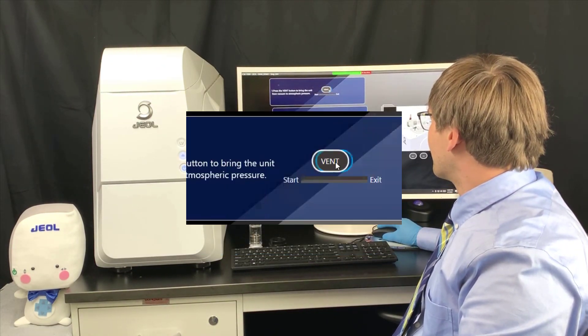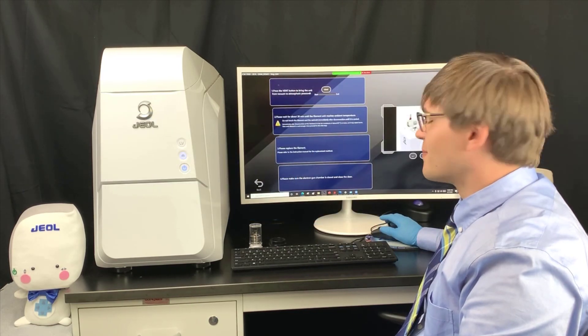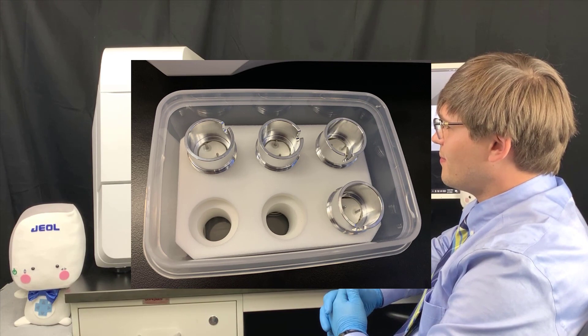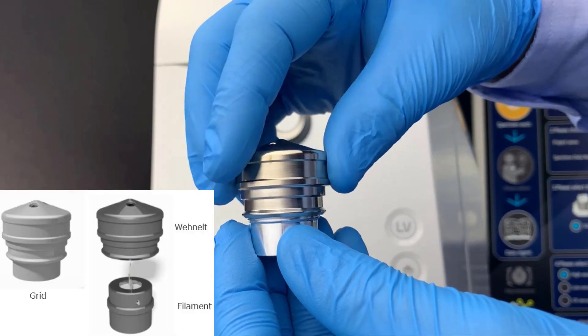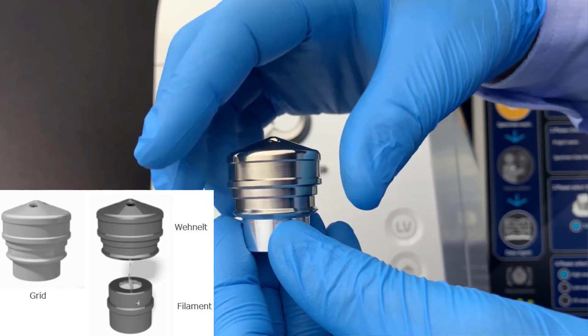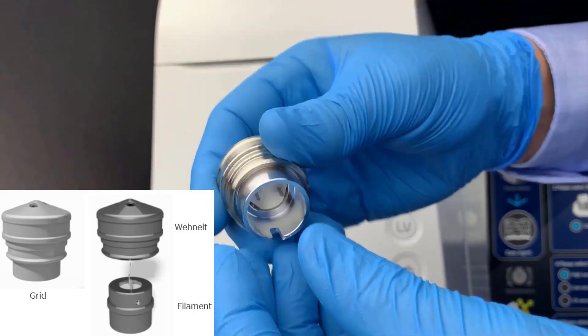Following the first step, we vent the system. Joel provides pre-centered, pre-aligned tungsten filaments, which can be assembled into a grid in advance to save time. To prepare the grid, insert the pre-centered, pre-aligned filament into a cleaned Wehnelt.